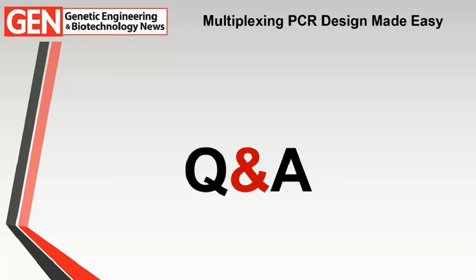So if you keep it the same as your benchtop instrument, which by the way does not have perfect uniformity by far, but if you keep it within those realms, I think the transfer and the efficiency would be similar to what you have in the benchtop. You know, 10%, 15% different. That's essentially what we have observed.